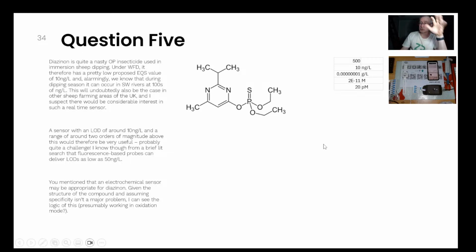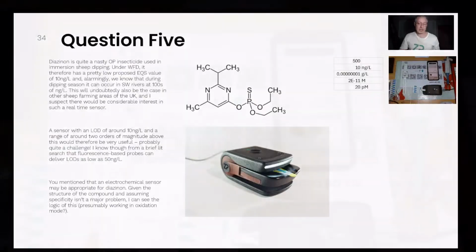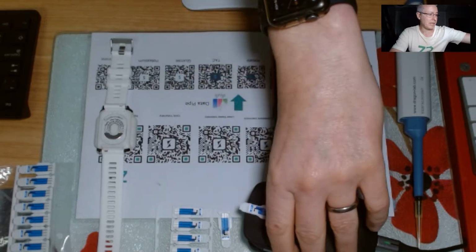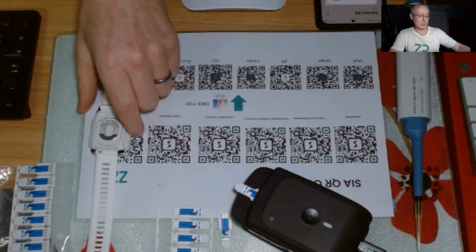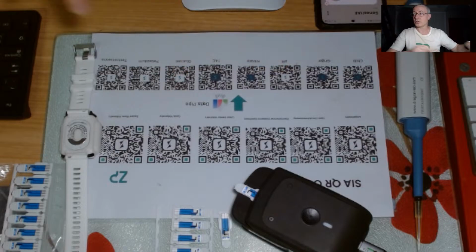Now, I always stand by this is an intrinsically electrochemically active molecule, and I say it can probably, at some point, an assay can in fact be developed to run on either this potentiostat or using the electrochemical methods and the data pipe actually give you a concentration of that molecule.